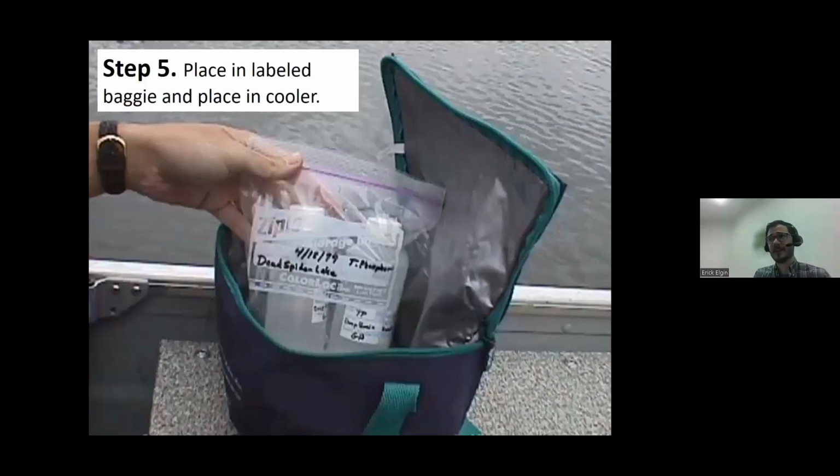Step 5 is place those labeled bottles into a labeled baggie. And so that would be date, lake name, and say total phosphorus, and place it into a cooler.